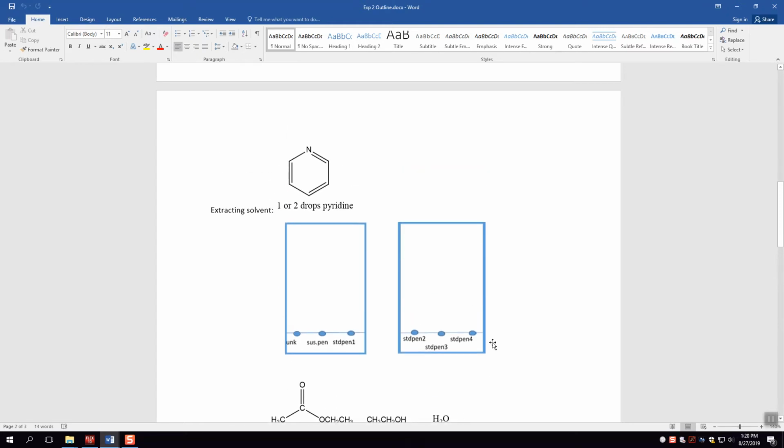If there's any other things about the ink that make you think that the ink came from that pen, use those as well. So if it puts down a specific pattern or thickness of the line or whatever the case may be, certainly use those things to help you.